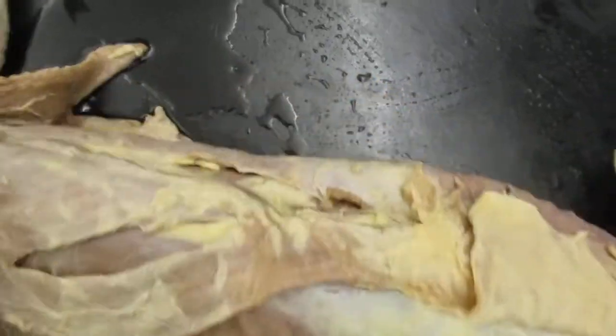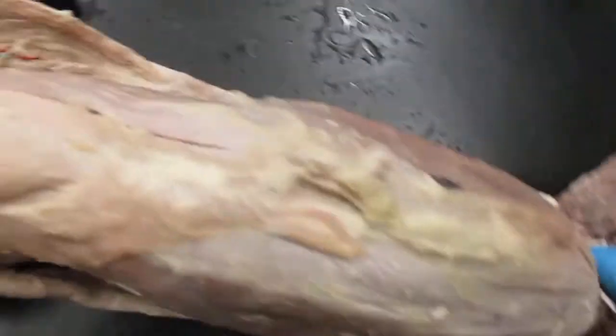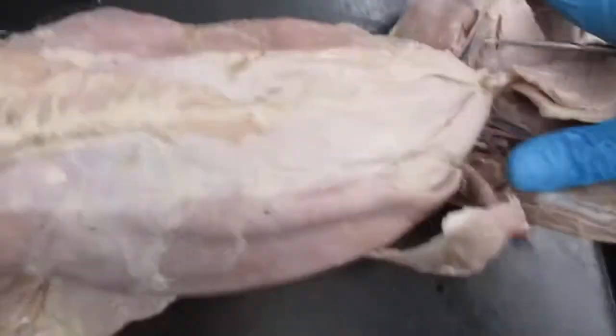Now, the rectus abdominis, or the six-pack muscle. Let me go over this cat here so you can see. Let me go over to this one. It's probably better here. Yes, much better. If it will stay there. Okay.